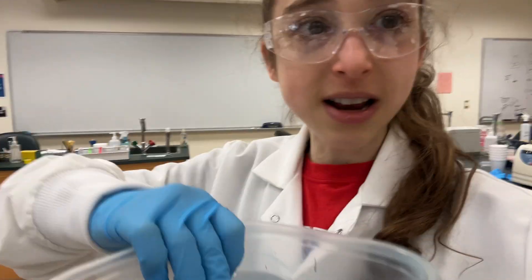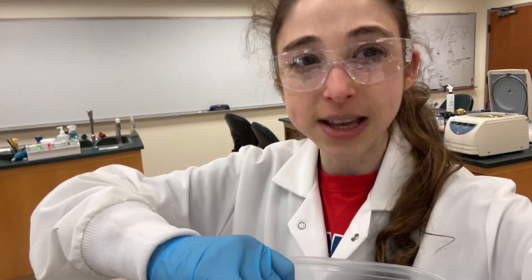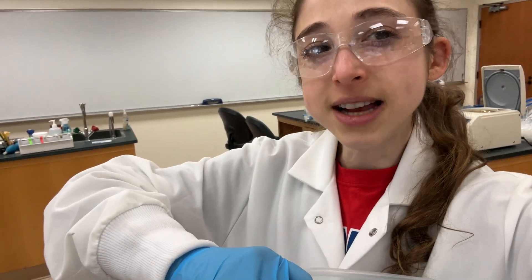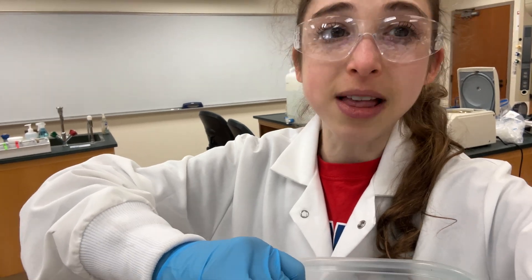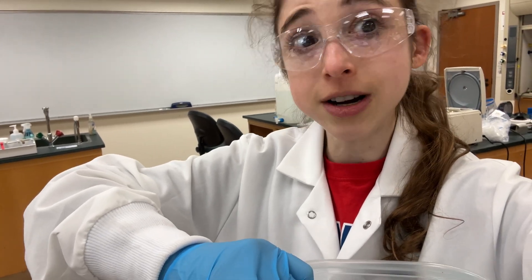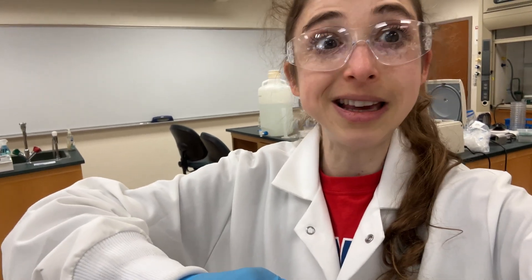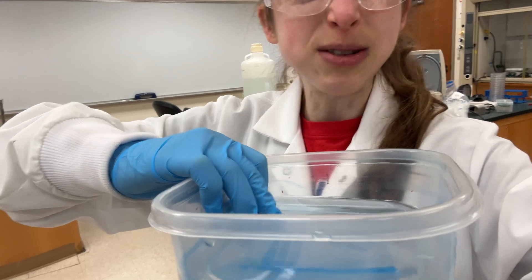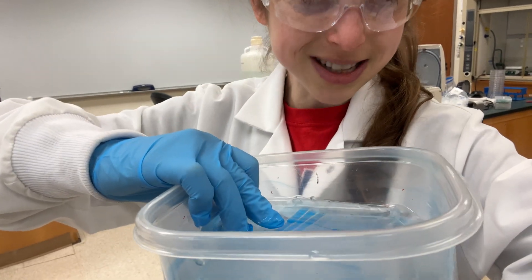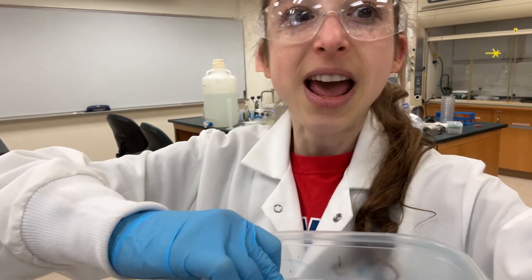We had purified this protein from a recombinant expression. Basically, we stuck the instructions for making the protein we're interested in — in this case it's malate dehydrogenase, which is a critical metabolic enzyme. We are studying the malate dehydrogenase from a bacteria called Bacillus defensis that we're interested in for bioremediation potential — basically it can clean up the environment. More specifically, we're interested in it removing metals, and we want to study how its metabolism is helping with this process.